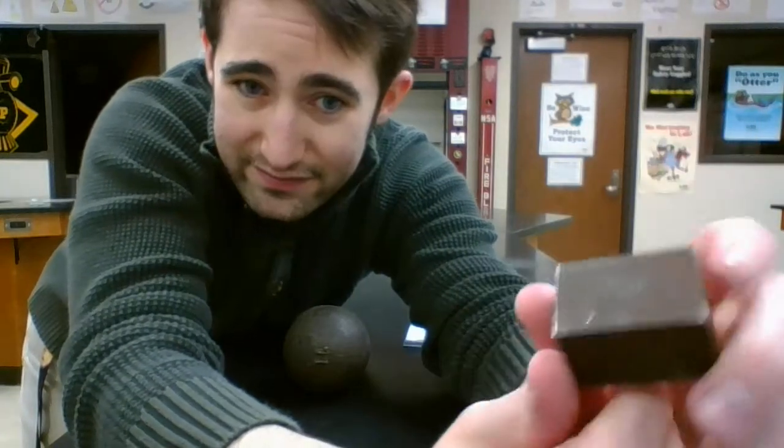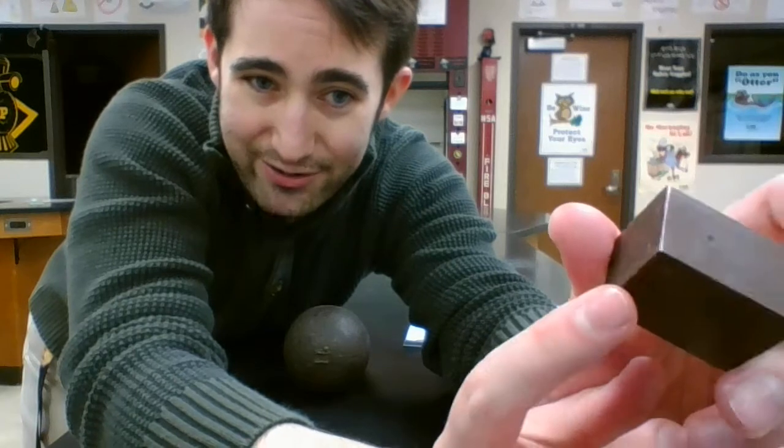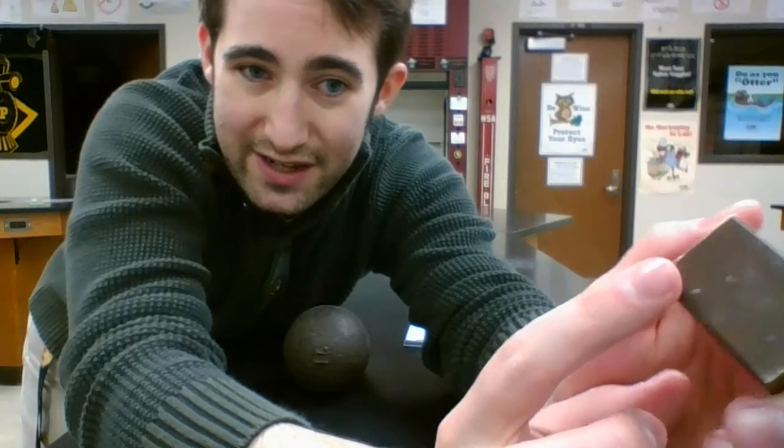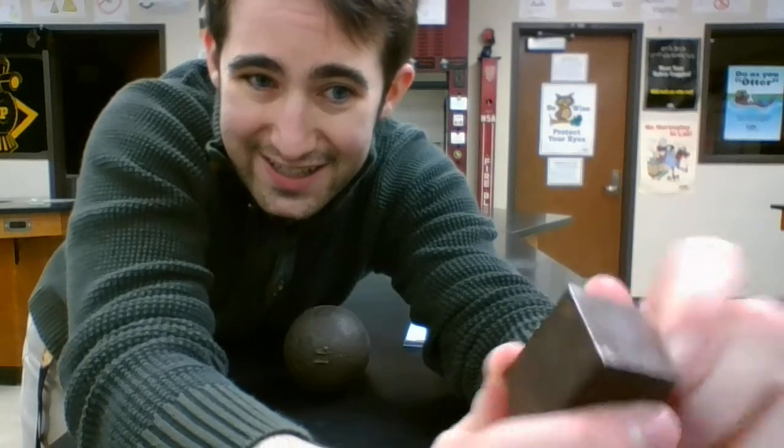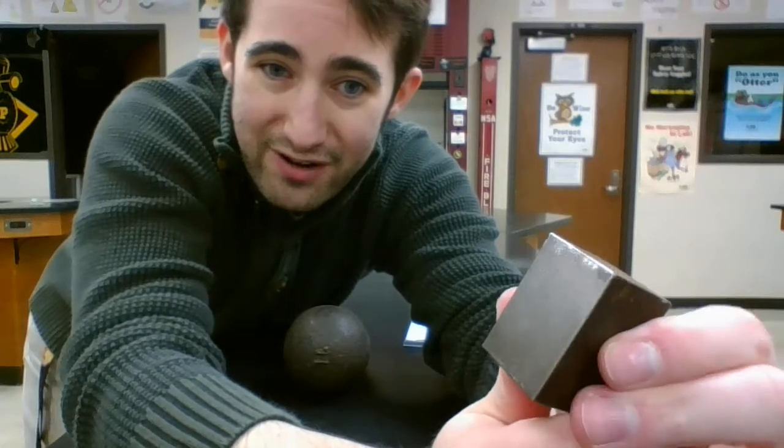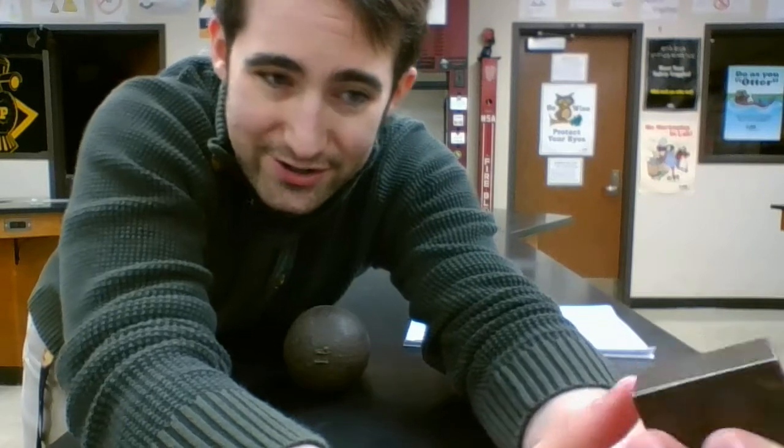You can also see kind of on the corners here where it's catching the light, that kind of original silvery color of the iron, where the rust hasn't gotten. So we can figure out if this is a pure substance or if it's a mixture.